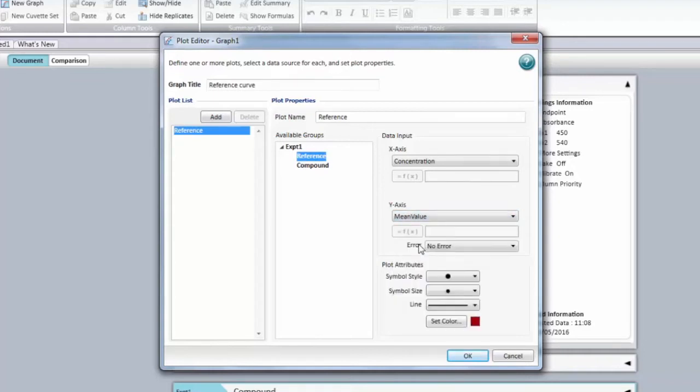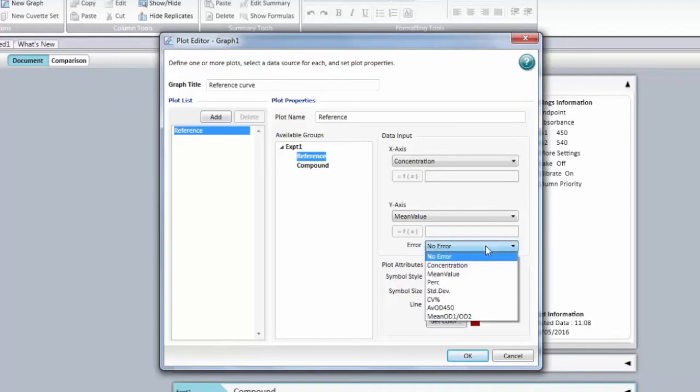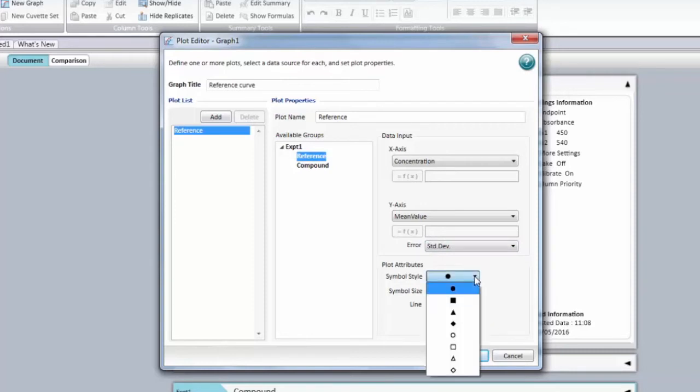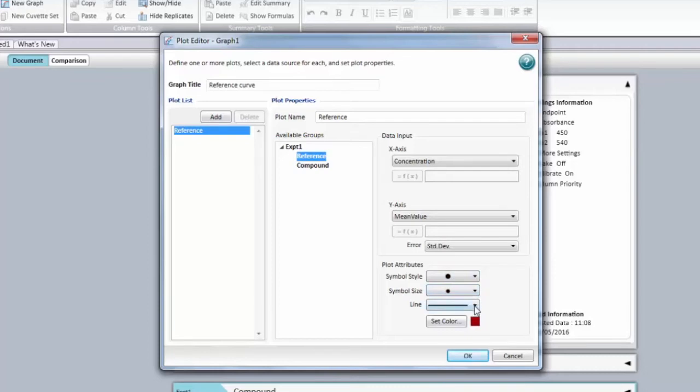If available, you're going to be able to choose to add error bars. Here we're going to choose a standard deviation. You can then change the symbol size, the symbol size and the line style. You can also change the color for the plot.